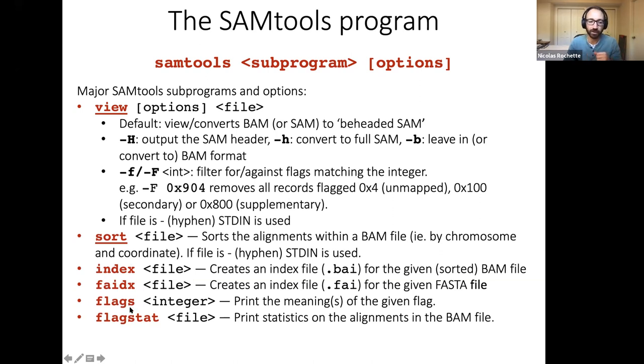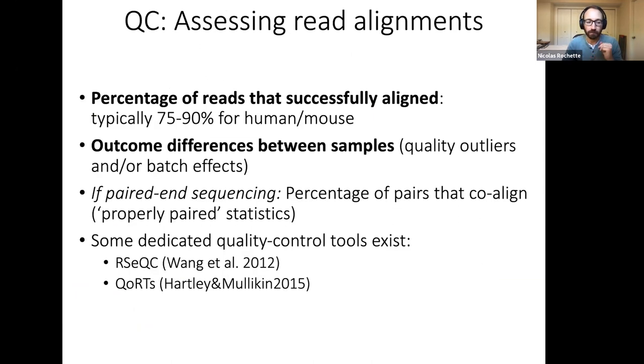The flagstat command, I mentioned it, just creates some simple statistics on a BAM file. Okay. And so the last thing I wanted to mention is that once we've done these alignments, there's going to be a question on how good our alignments are.